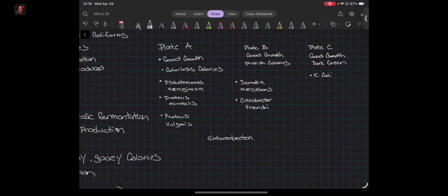And the Citrobacter, you would look at which test? And then that one would be blue. What test? The citrate, and then you would narrow it down between, I think it would be the urease test, or I'd have to double check. One test will rule out both. So this test will rule out E. coli and oxidase will rule out Pseudomonas.